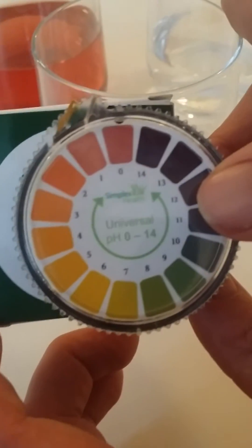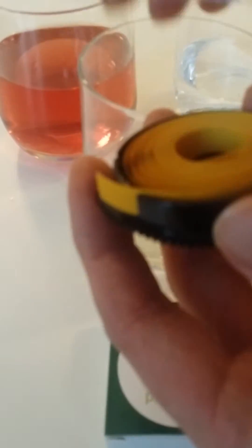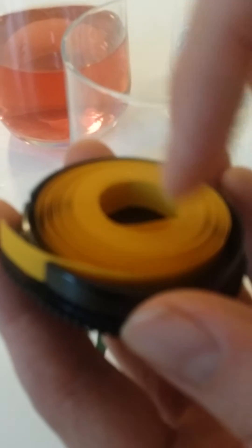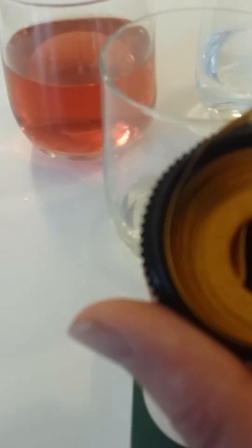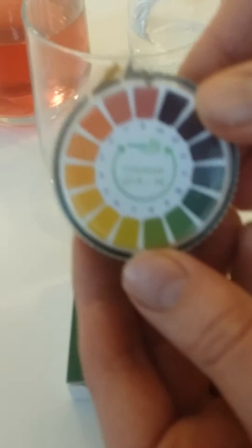When you get your pack it comes in a box like this, and then inside will be your litmus paper on a roll. First thing you'll need to do when you receive it is open the case. The litmus paper will be in a silver foil — you need to take it out of there first, feed the litmus paper through the top there, and then you just replace this part here and then you're ready to go.